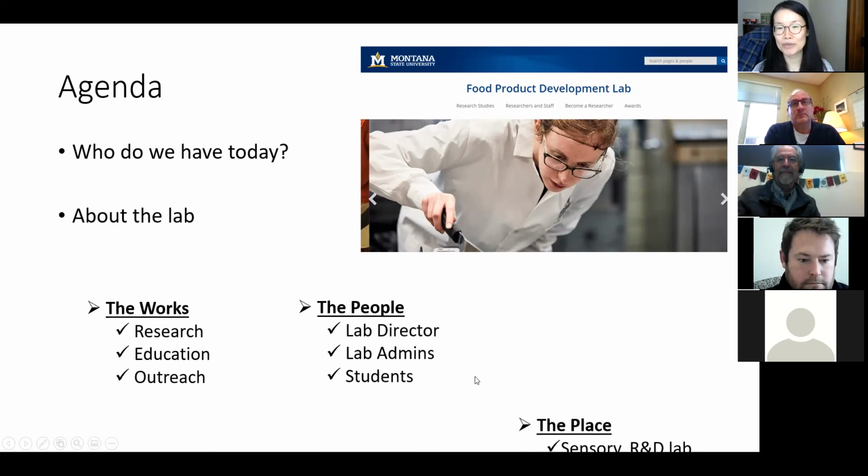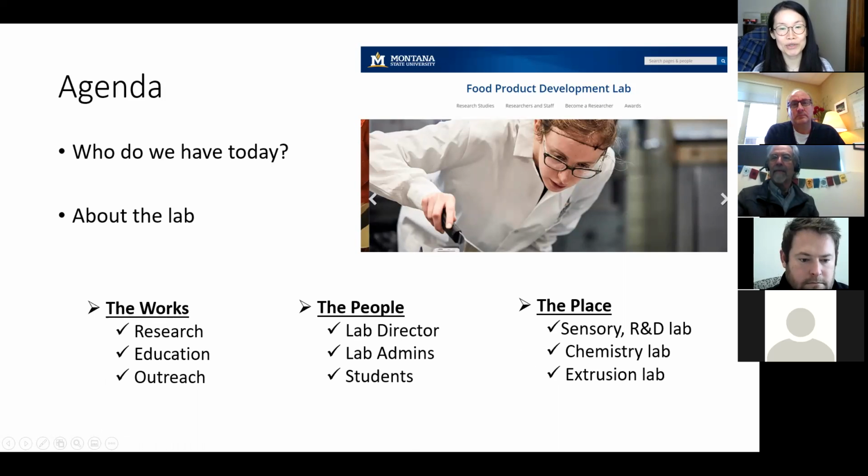So today I will share with you what we do in terms of research, education, and outreach. And part of the outreach is via the testing service agreement, so that we help the local food company or growers or interest groups to do some product improvement or product development research. And I'll also share who we are, me, myself, and some staff and students. I will also show you some pictures of the lab research R&D space, including the sensory and product development space, and the chemistry space and extrusion space.